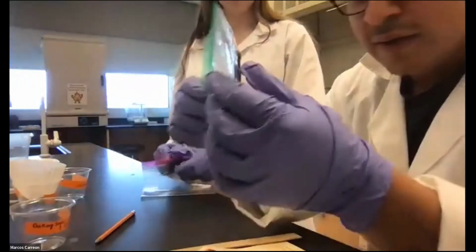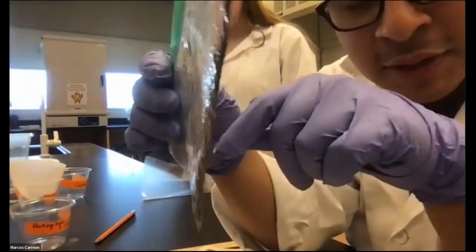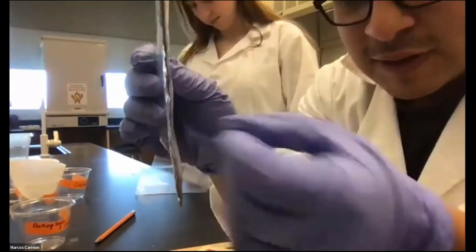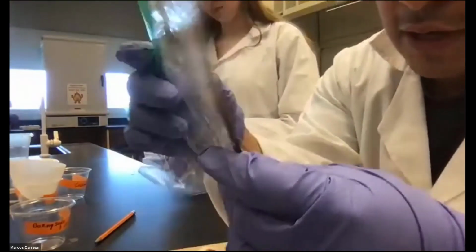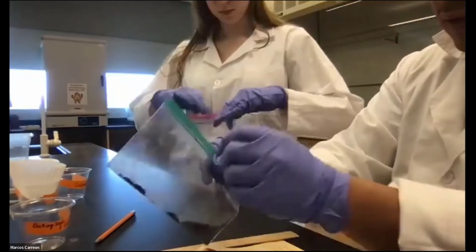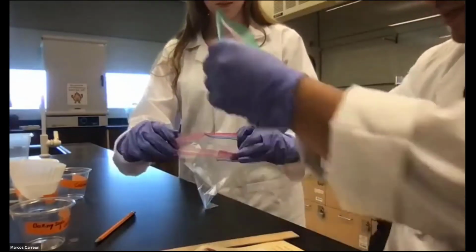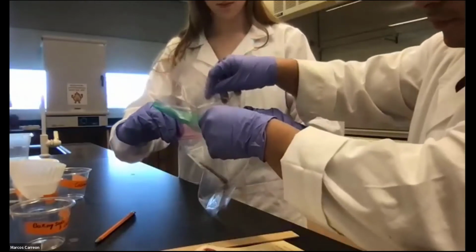So what we're gonna do now is transfer this, because it does have some holes. When we add water into here, we don't want it to spill out. So we're gonna go ahead and put it into a different bag. Good thing I have Lynette here. She's gonna hold that bag for me. So I'm gonna place it in there.